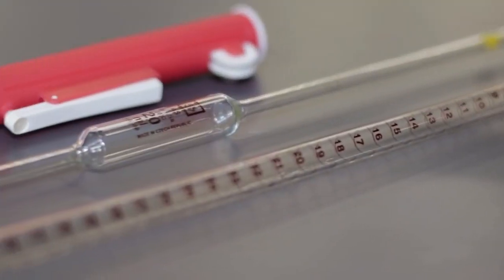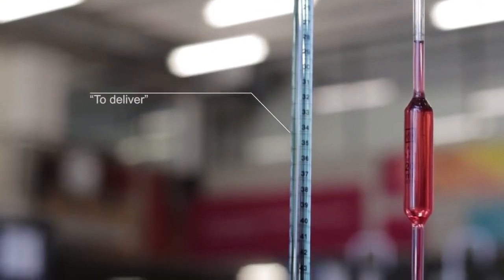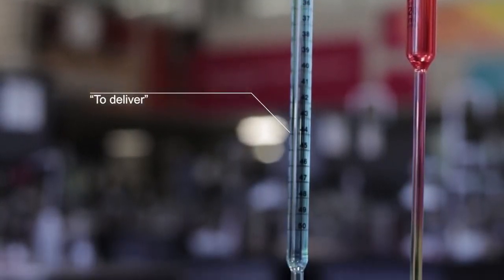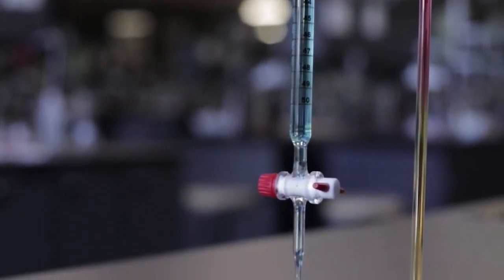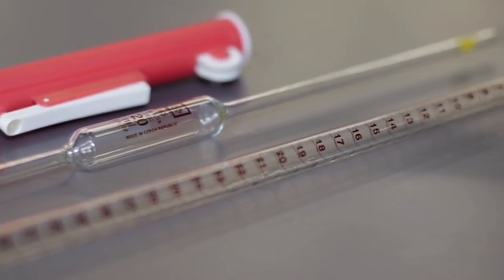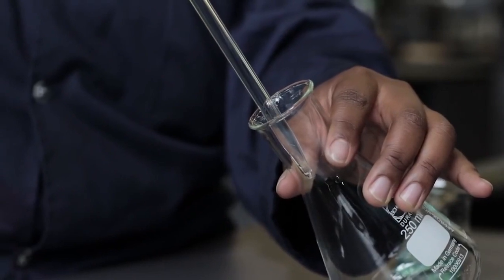The second type of glassware is classified as to deliver. To deliver glassware refers to glassware that is designed to deliver a precise volume. They are designed to contain a little more solution than the indicated volume so as to deliver the precise volume stated on the glassware. This is due to some of the liquid sticking to the sides of the glassware.